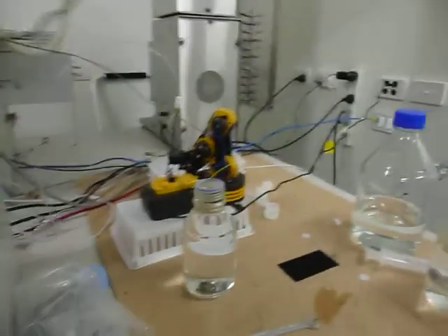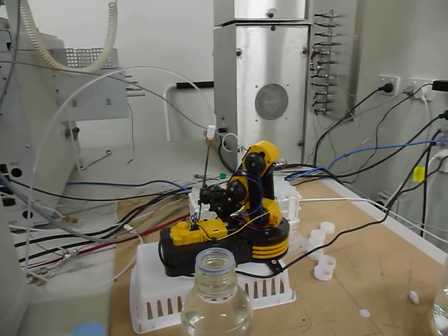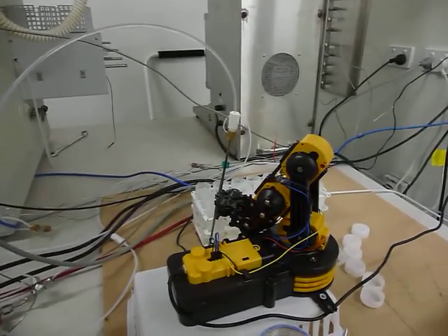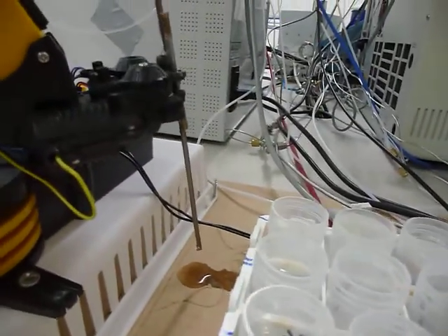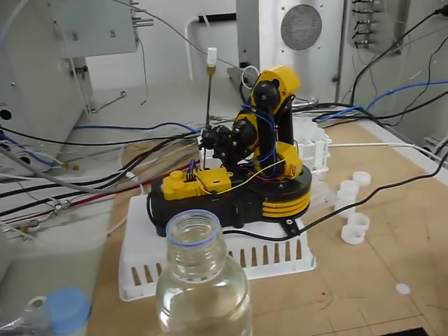So what happens? There is the robotic arm that you saw working a few seconds ago. It's my autosampler. I bought this for $89. It's a toy. I made some modifications on it. It was designed to be used with batteries, but I adapted a power supply using those wires here just below. You probably cannot see very well, but they go inside the box.